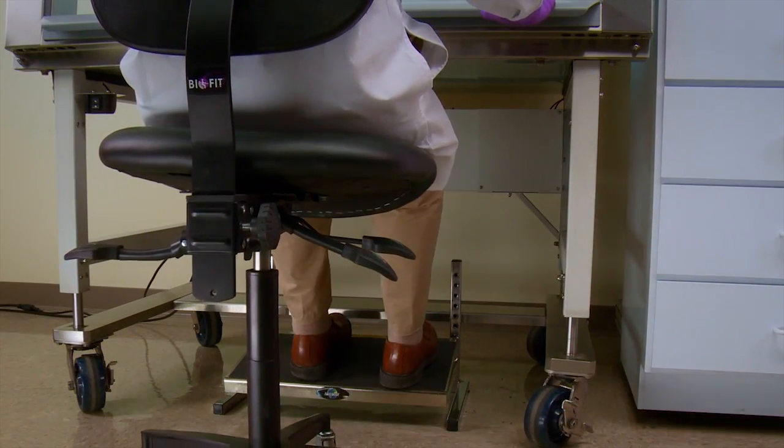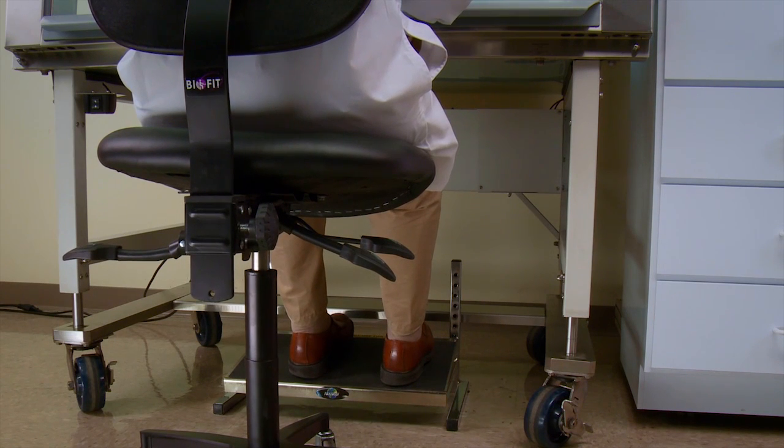NuAir Biological Safety Cabinets provide maximum knee and thigh clearance, which allows the user to assume a proper posture.